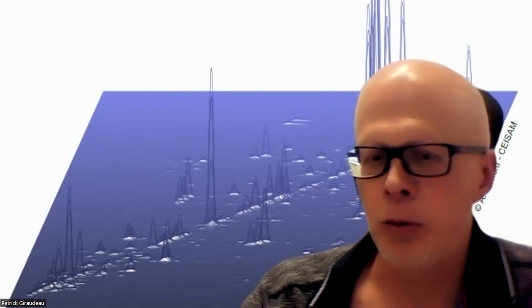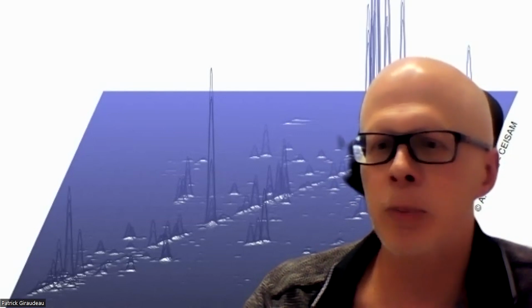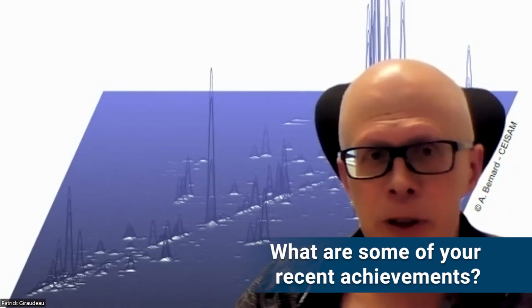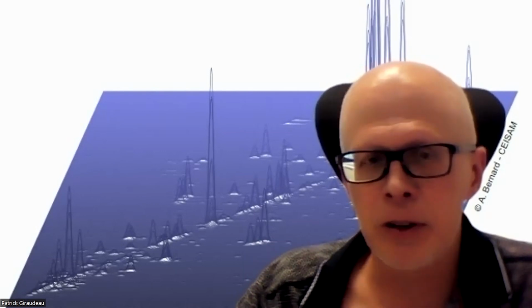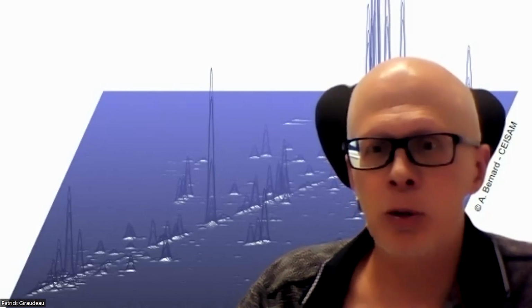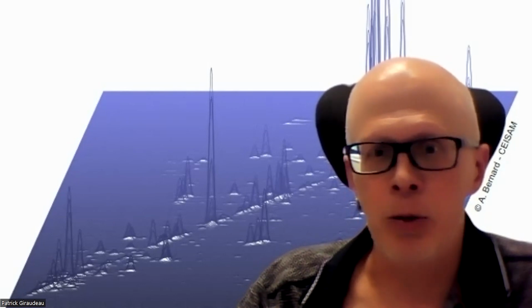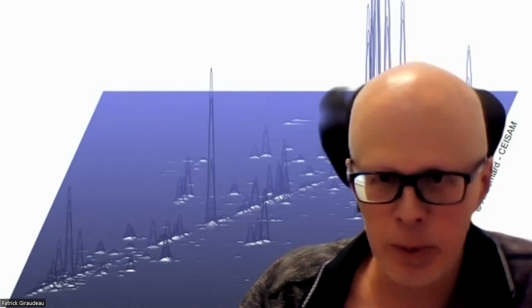We have also a very original development project, including the development of hyperpolarized methods in collaboration with Bruker, actually, through a prototype system that was installed a few years ago. We've been recently achieving very interesting results in different fields. I could mention maybe two of them. The first one is the development of new ultra-fast 2D NMR methods, which are specifically tailored for the analysis of samples that evolve in time or that need to be analyzed in a very short time.